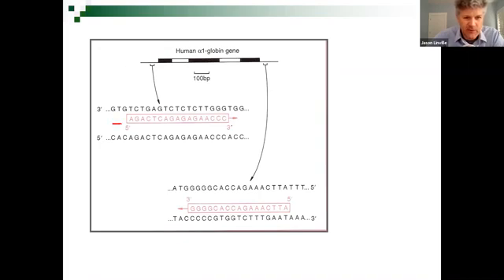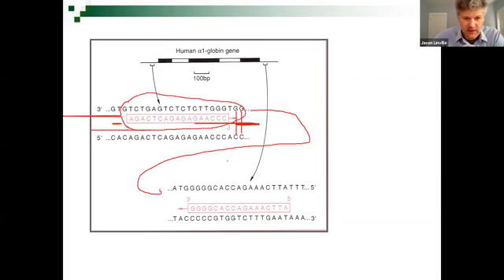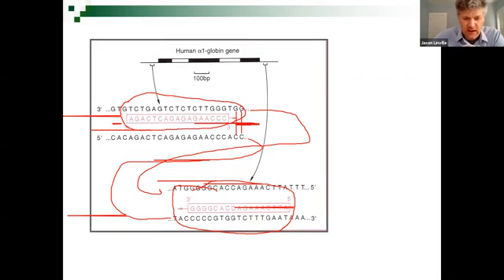This sort of shows you the DNA splitting apart. We're really not going to go into a lot of detail about 5' 3' here. But originally, this G is attached to the C. But when you heat up the DNA, the two strands split, the ladder breaks, right? And then the primer attaches to one of those strands at one end. And then this DNA is sort of connected down here, and this DNA is connected down here. And then the other primer attaches to the other strand at the other end. And then the polymerase is going to sit down right here.